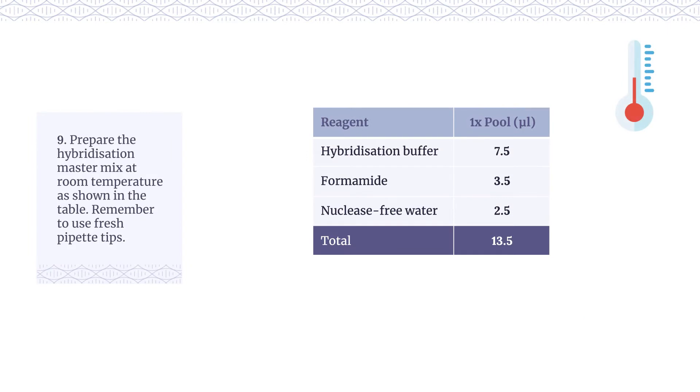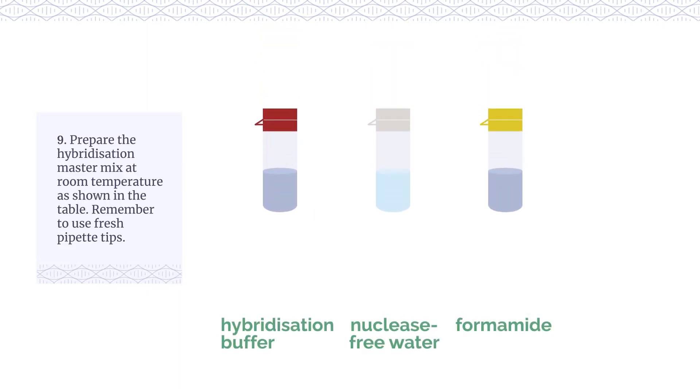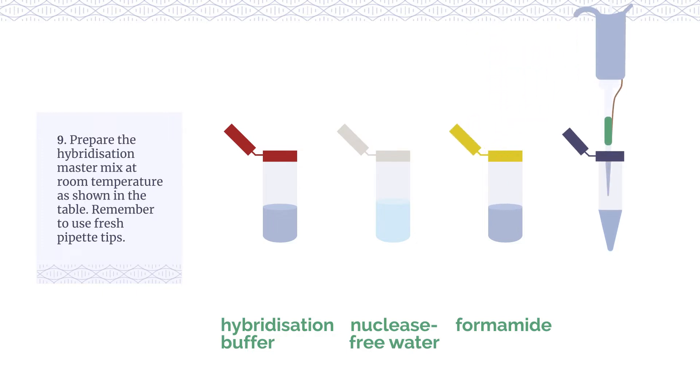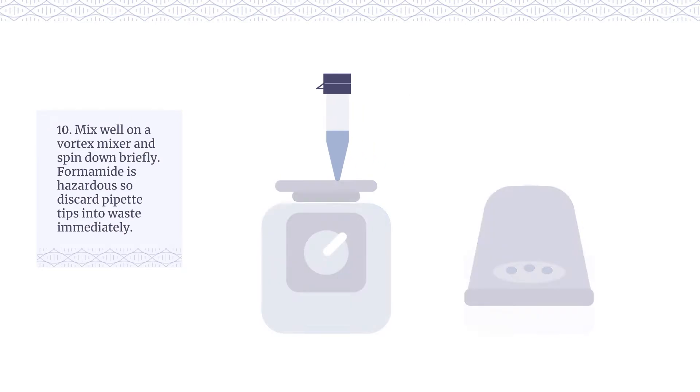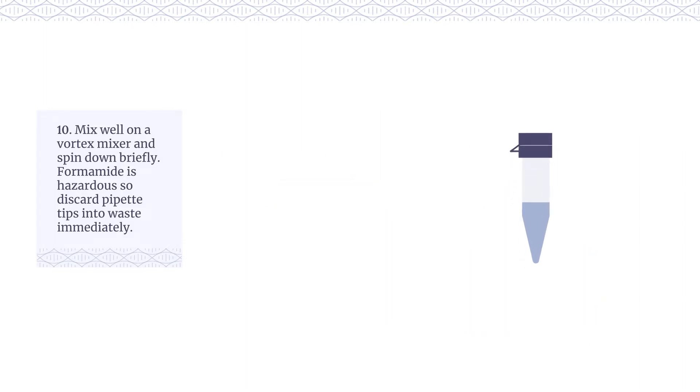Prepare the hybridisation master mix at room temperature as shown in the table. Remember to use fresh pipette tips. Mix well on a vortex mixer and spin down briefly. Formamide is hazardous, so discard pipette tips into waste immediately.